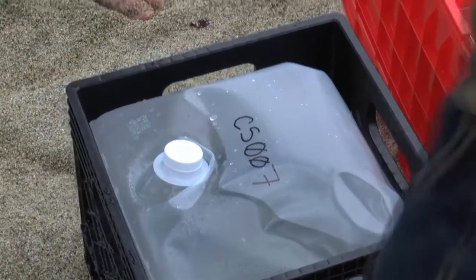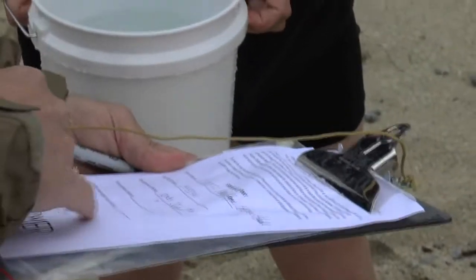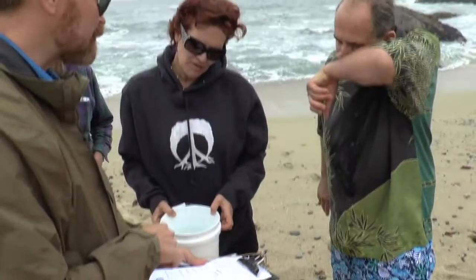We'll make sure that we have both a date, a time, and a location. I wrote it up there and took it down. And eventually we're going to want to know the latitude and longitude of this specific site.